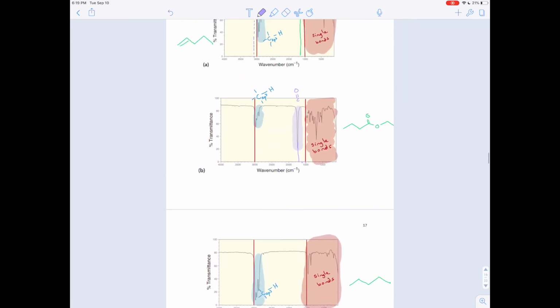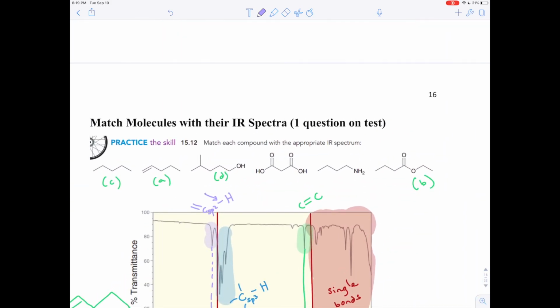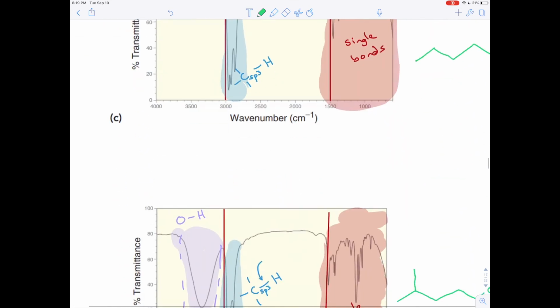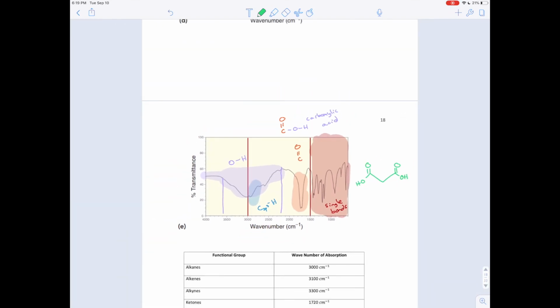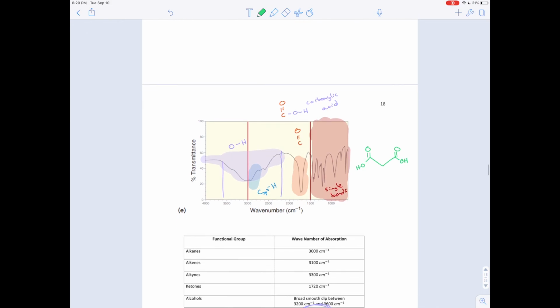So let's look at what molecules they gave us that have carboxylic acids in them. There is only one, and it is this one right here. So you have those 3 carbons, and a carboxylic acid on either end. Notice, we couldn't get the structure of the exact molecule. We don't know how many carbons you have looking at the IR spectrum. All you know are what functional groups you have, what type of bonds you have.